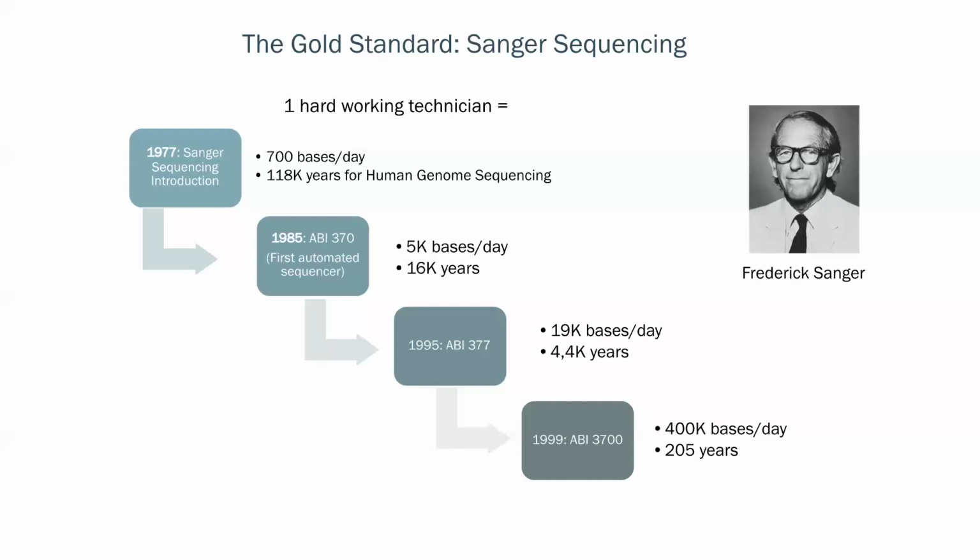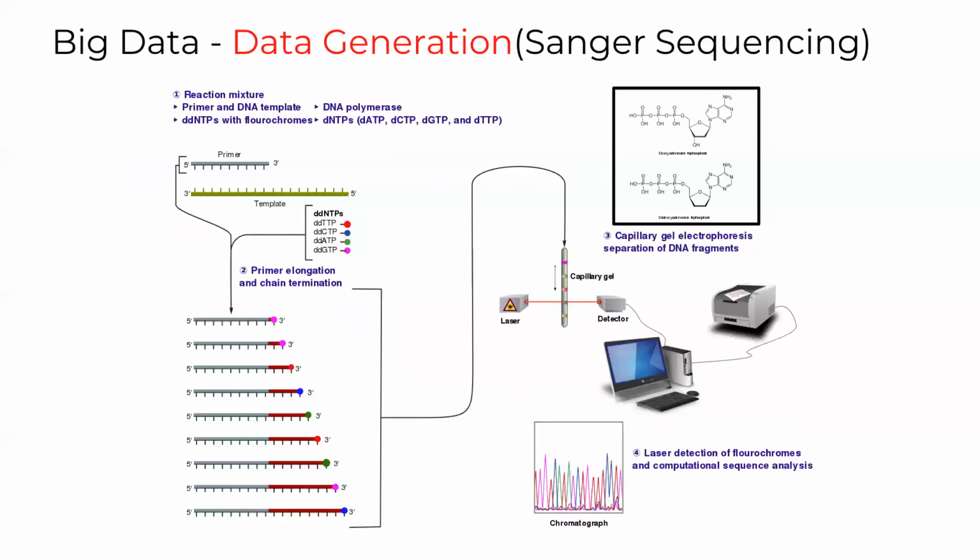Sanger sequencing is the easiest method to resolve these uncertainties, and therefore it is an invaluable protocol in any clinical genomics laboratory. But as we'll see later, next generation sequencing is much more high throughput. So here's an example of the Sanger sequencing method.